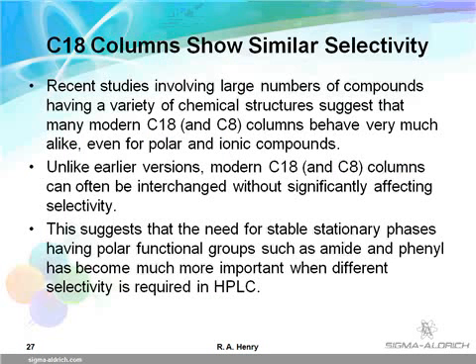The next slide suggests that modern C18 and C8 columns are becoming much alike due to evolution of silica particles and development of improved bonding chemistry. Changing from a C18 to a C8 or from one brand to another may not produce a different, better result. When resolution is not acceptable for any reason, an alternate stationary phase with more polarity than C18 or C8 may be the answer. The remainder of this seminar will be an introduction to how the stationary phase can play a unique and important role in changing retention and selectivity for certain classes of compounds.